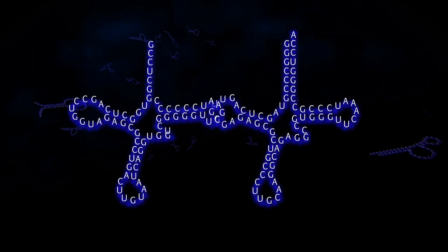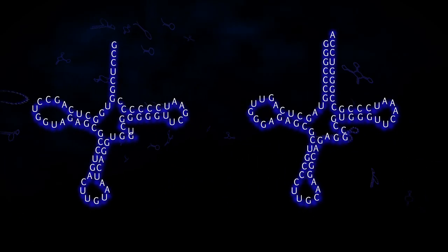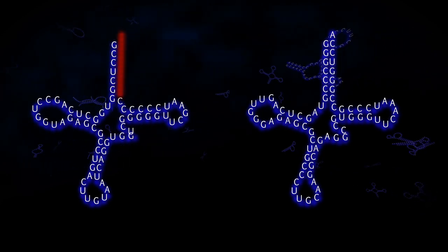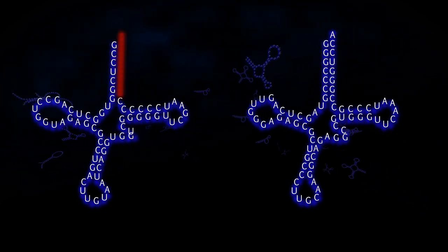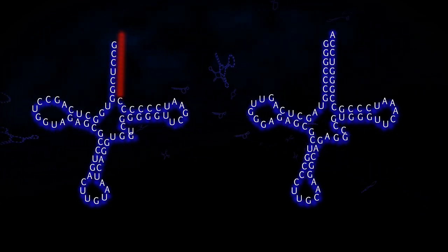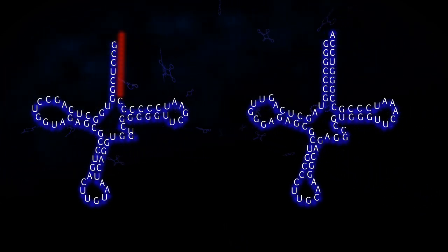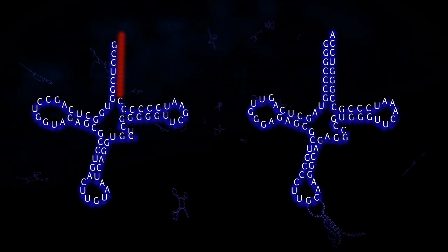By this, both the similarities and also the differences of the RNA molecules — for example, missing parts — become visible.